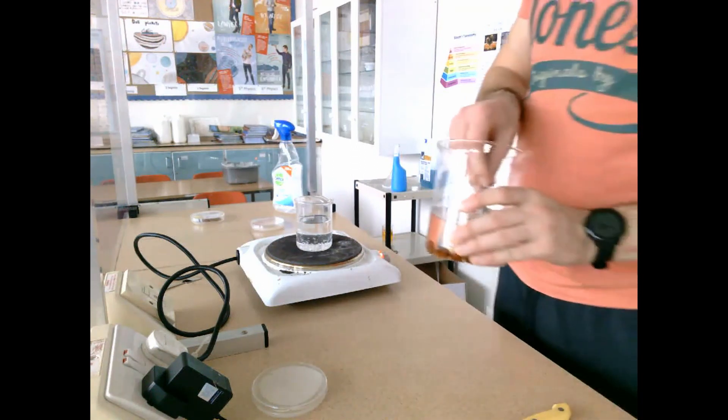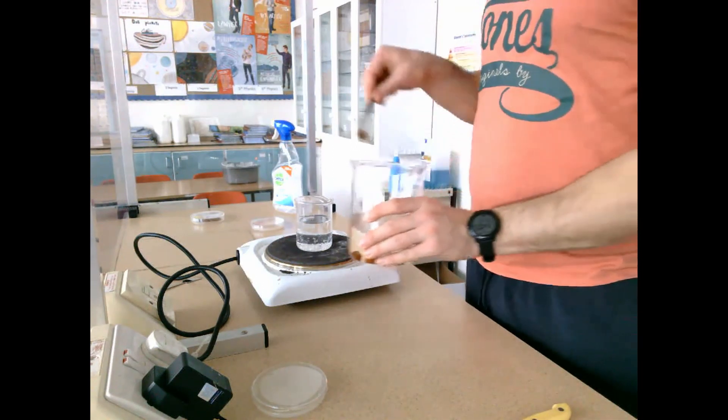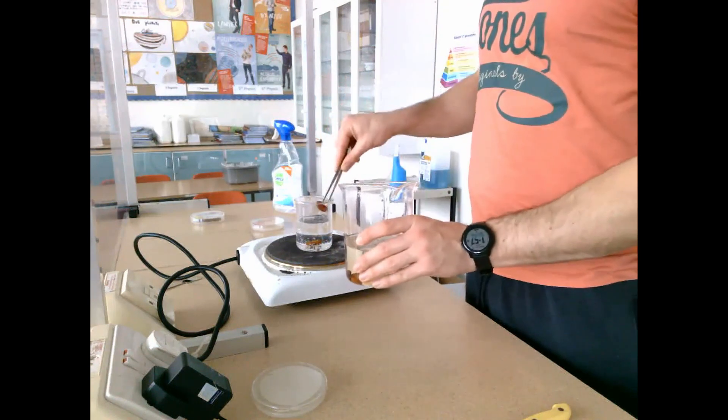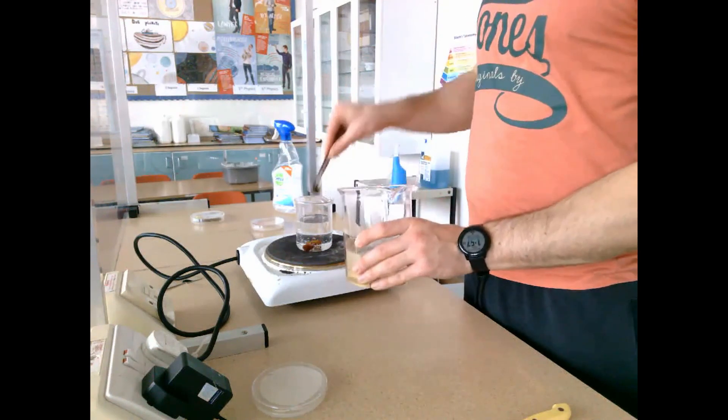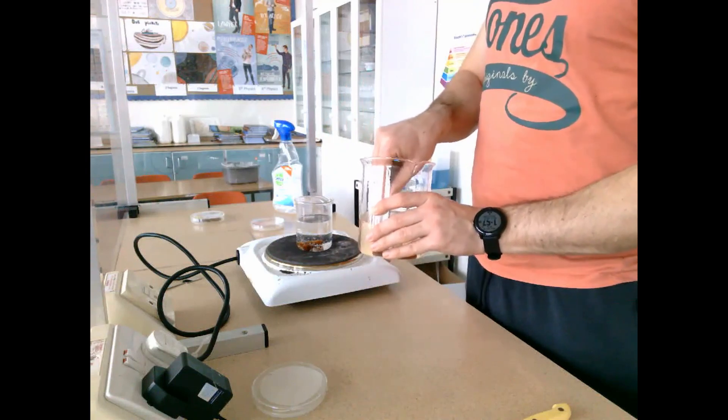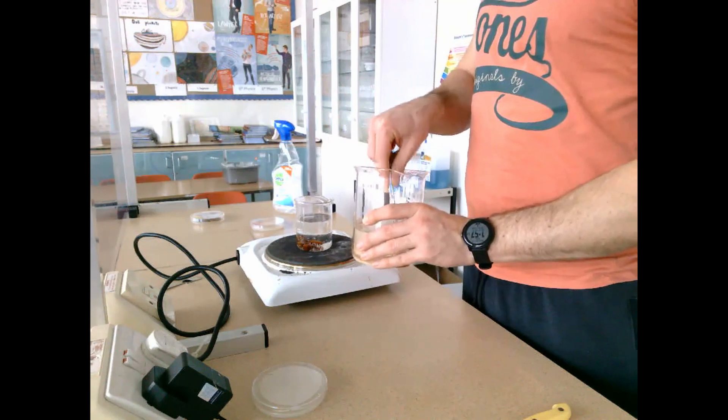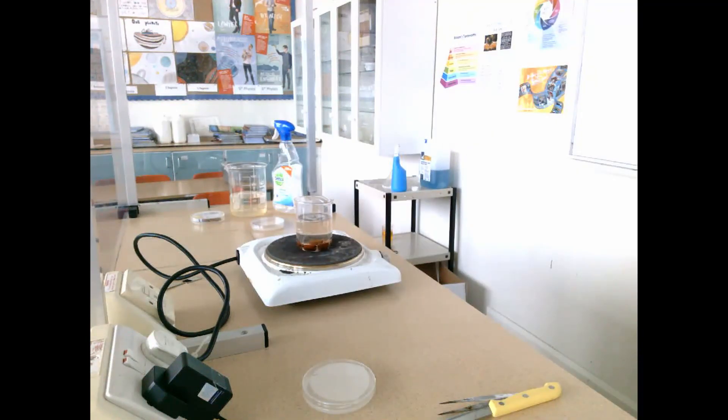I disinfect the area again because I'm using a different set of seeds. The forceps and knife are disinfected, then I place the seeds into water on heat. I'm going to boil the seeds for 15 minutes to denature any enzymes present and kill those seeds.